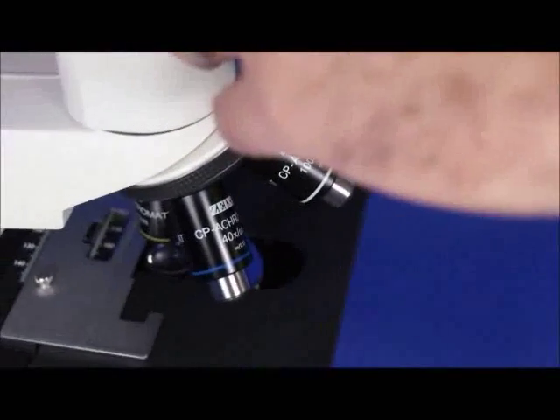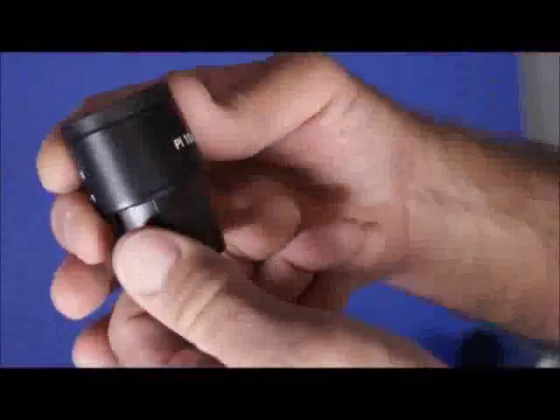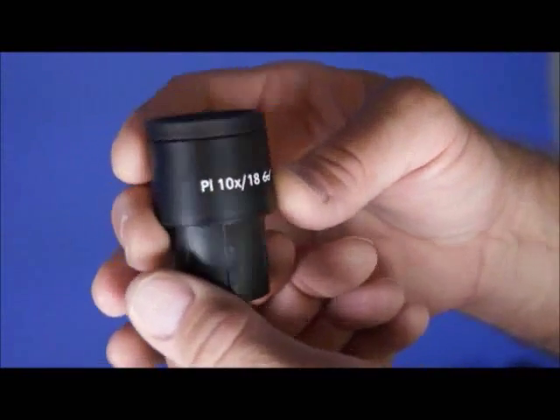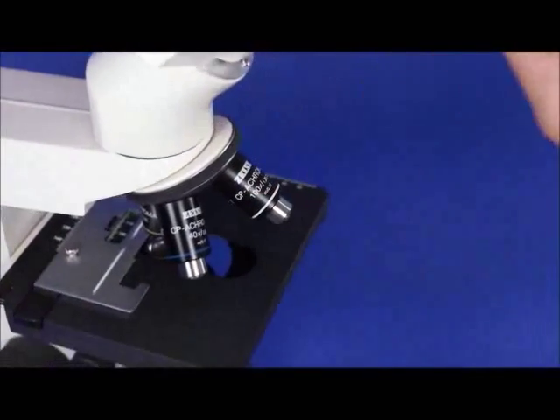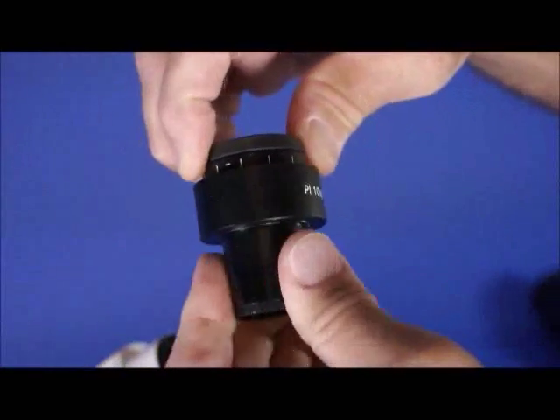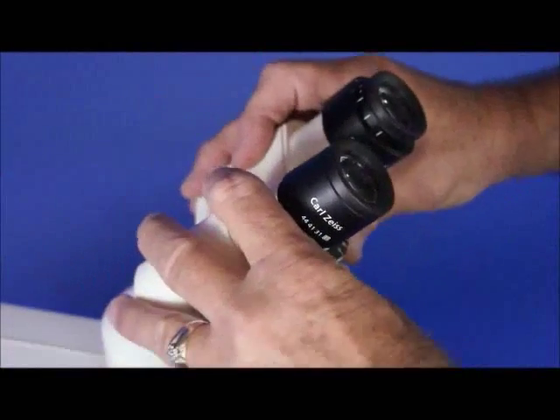Talking about your eyepieces — these eyepieces are Zeiss 10x PL 18s, high eye point. They are also highly corrected to match the correction of the objective lenses. The right one focuses so you can maintain par focality between the eyepieces and maintain proper visual acuity.